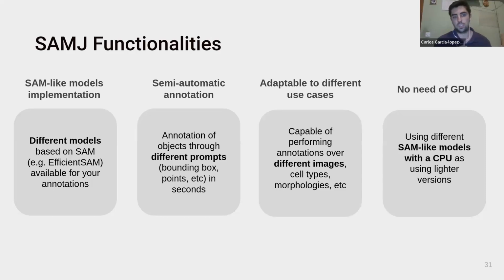You can just choose the model depending on how good your computer is, or how difficult your images are. The more difficult the images are, the better, heavier model you would like to use. But if your computer is not so new or not so powerful, you can choose a lighter model, which works quite well too, and then modify the ROIs using the Fiji tools.